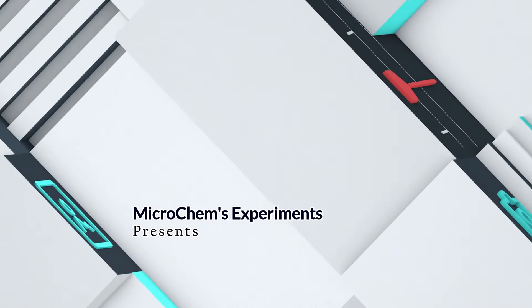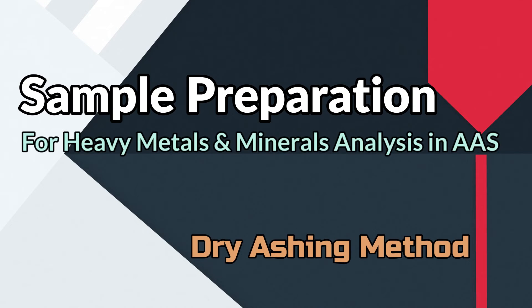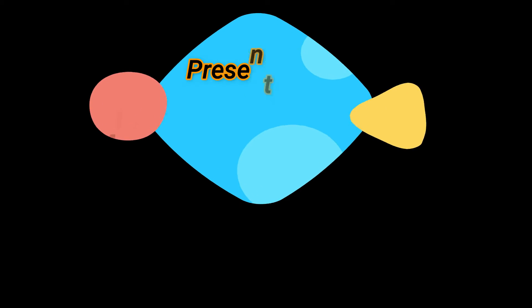Hello viewers, today we will show you the sample preparation procedure which is very crucial to analyze it in atomic absorption spectrometer. Dry ashing is the most common method to prepare samples for heavy metals and minerals analysis.